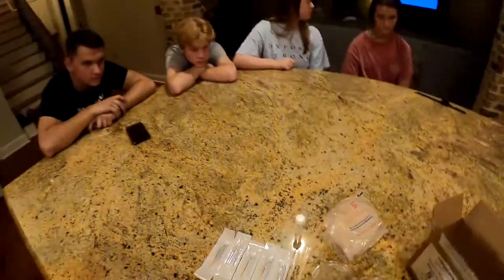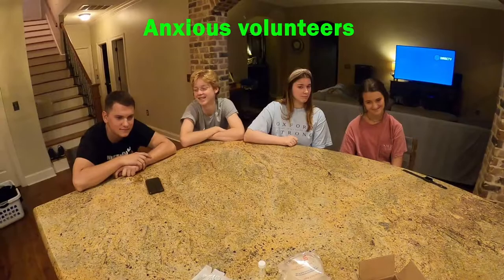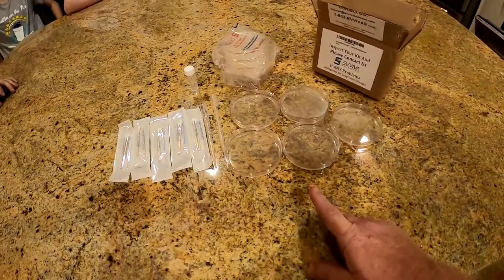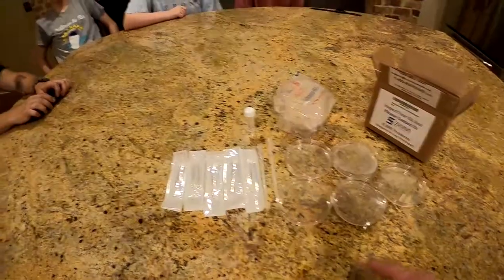We're going to give each of my volunteers a cotton swab. They're going to swab some part of their body, rub it on the petri dish, and then put these in an incubator for 7 to 10 days to see what sort of bacteria grows. Let's get started.